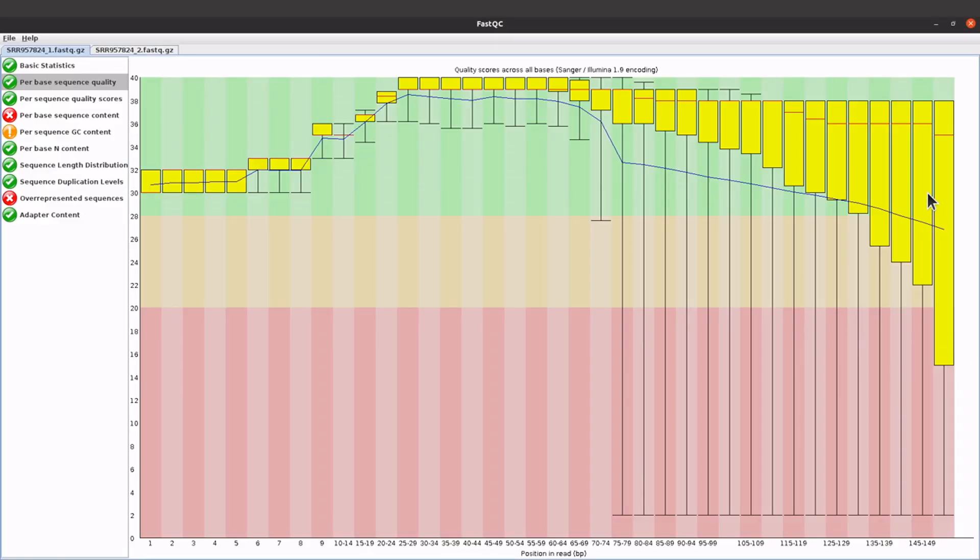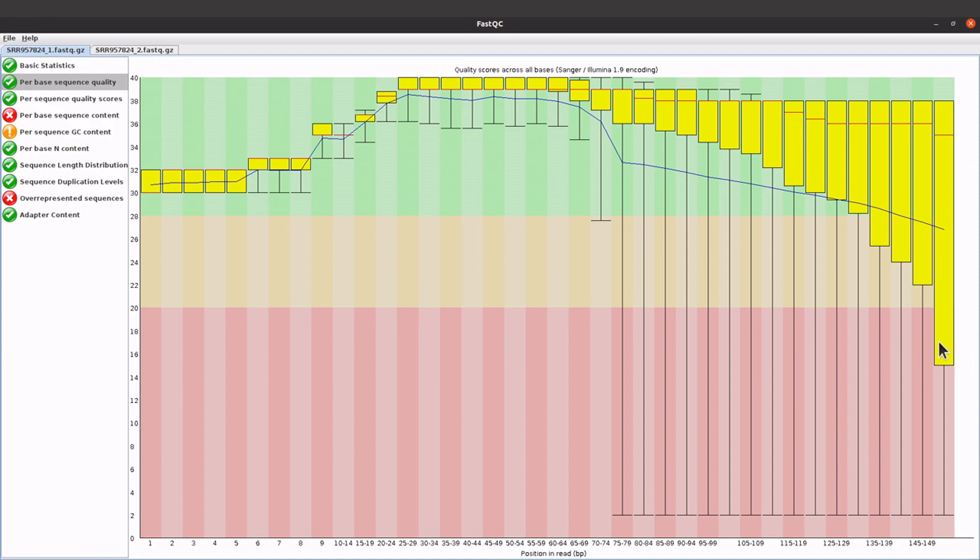If you have some of your bases in this region, the quality being in this region here, you can do what you call quality trimming to trim those reads that have poor quality. You can use tools like Sickle, Trim Galore, etc. to do that trimming, and that will help you to improve the quality of the reads that you have here.